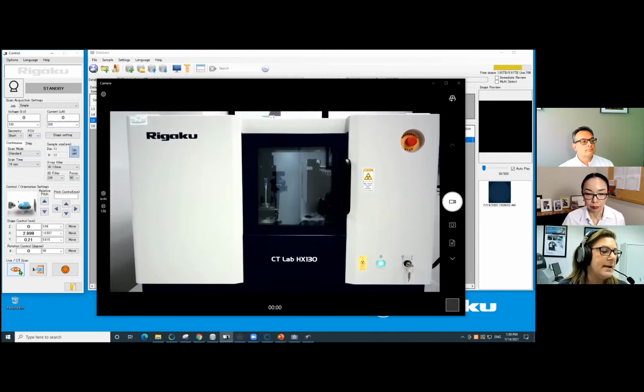Now, for our next poll, we want to ask you basically, before we start this experiment, what should we be most interested in thinking about? So I'm going to ask you that poll question. Okay.